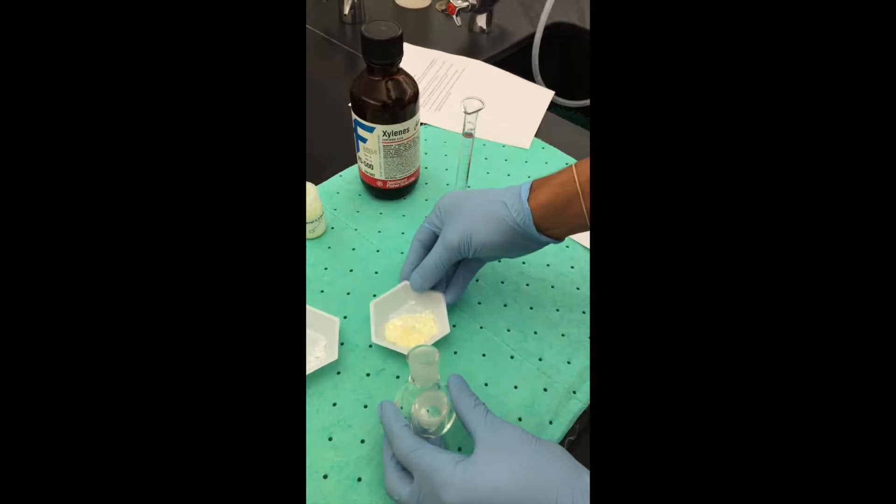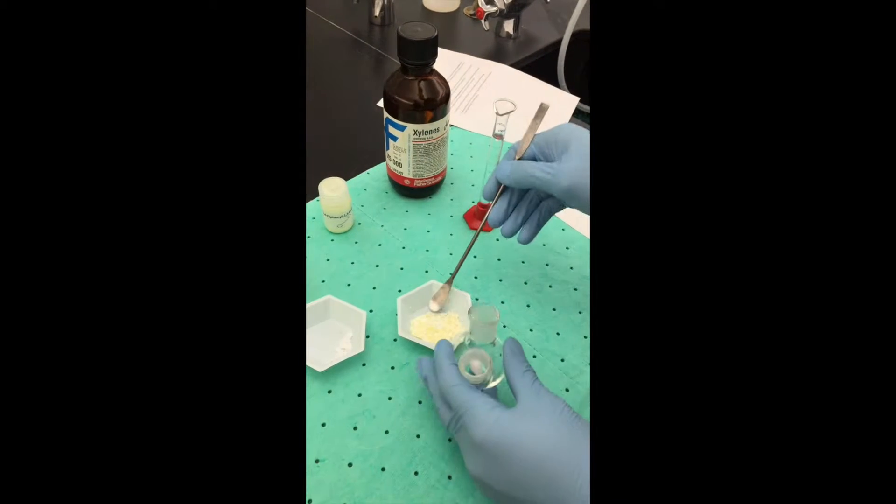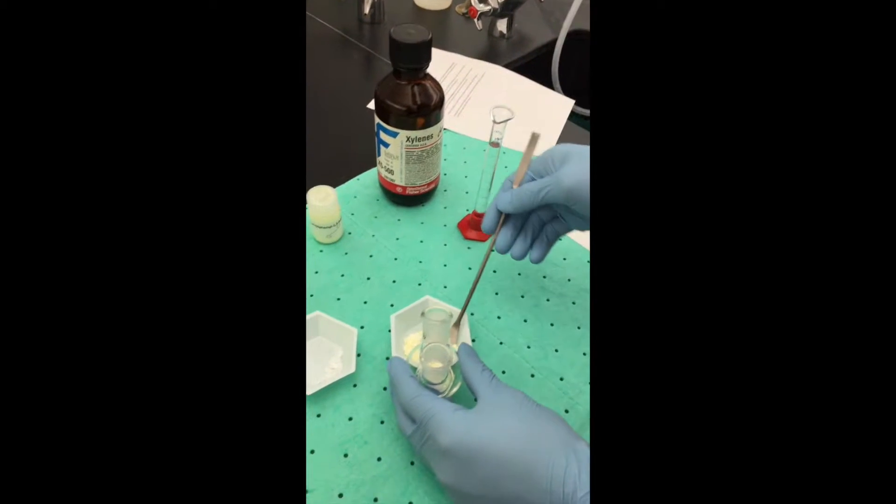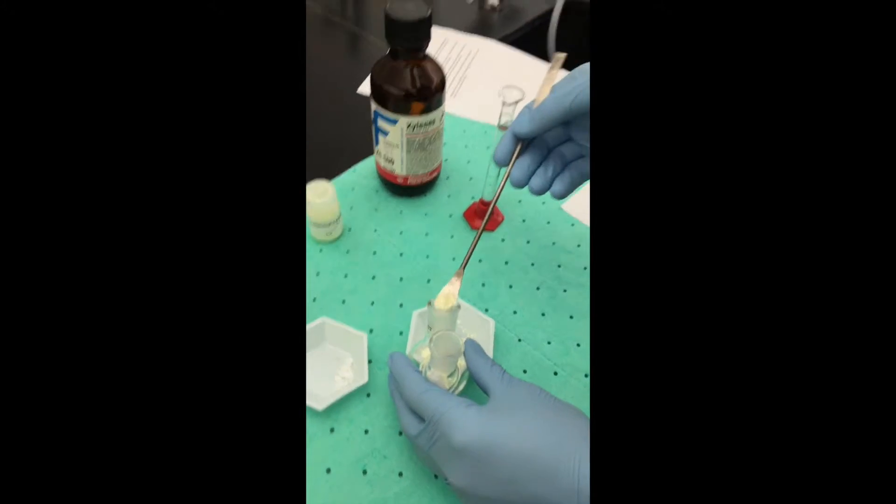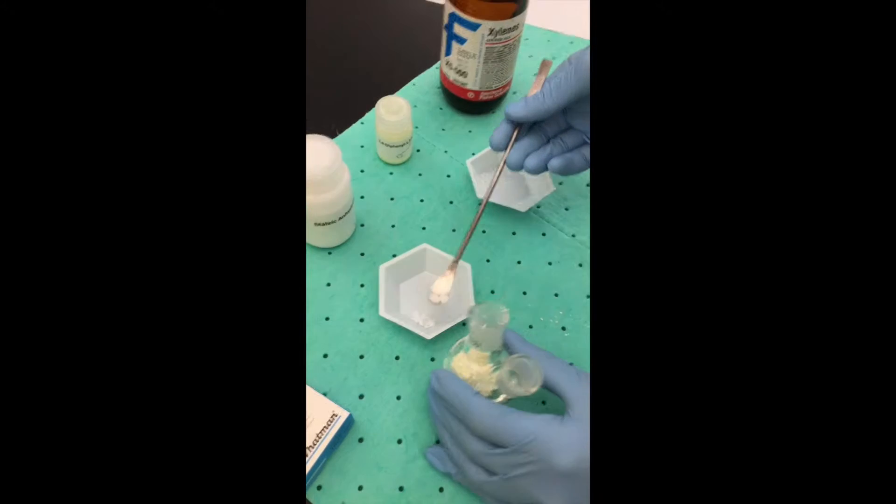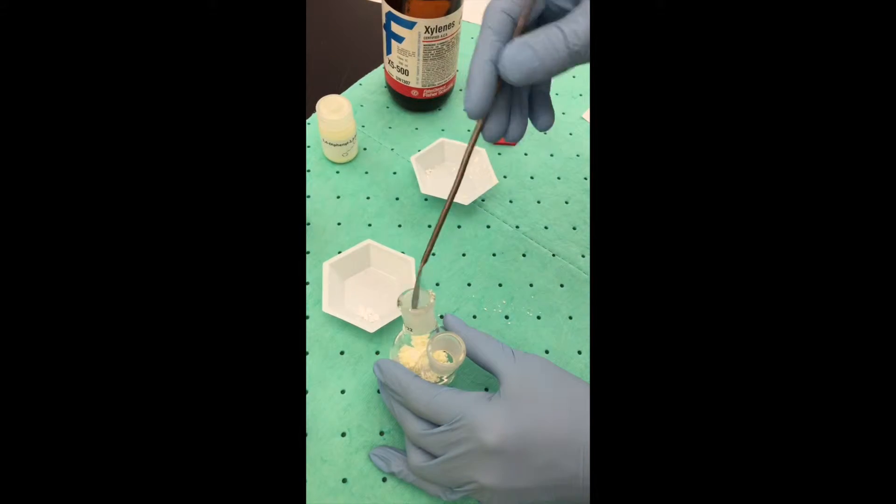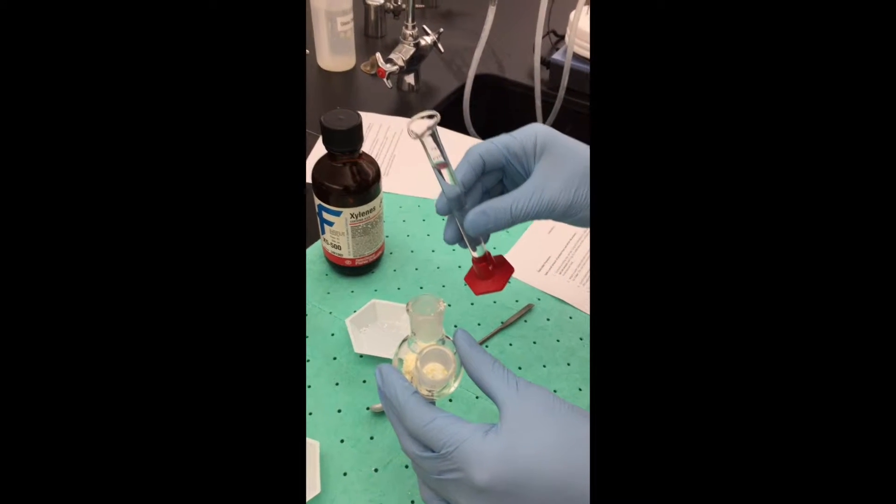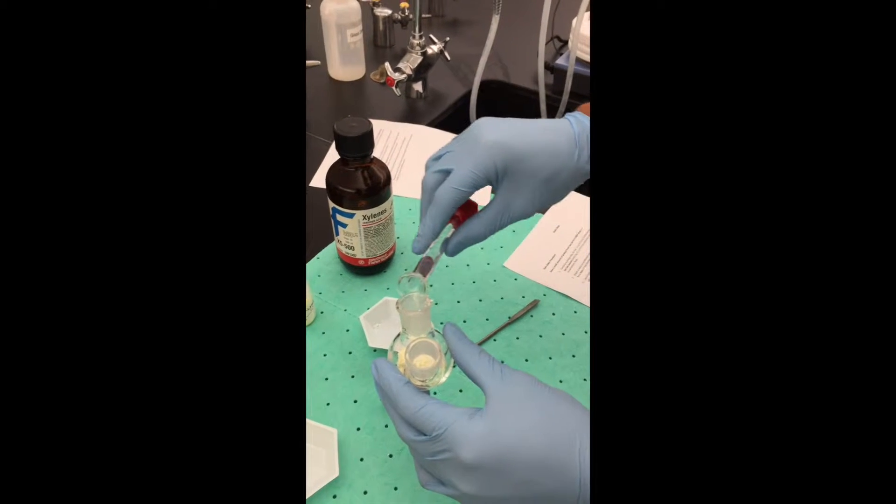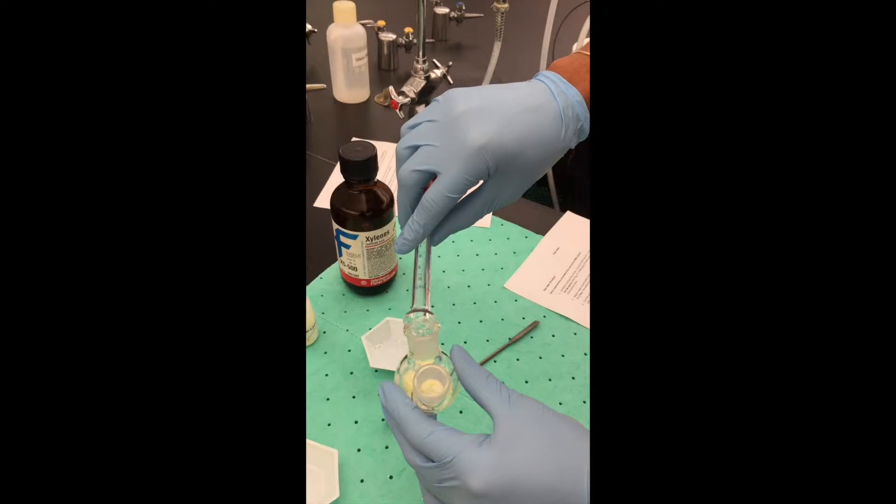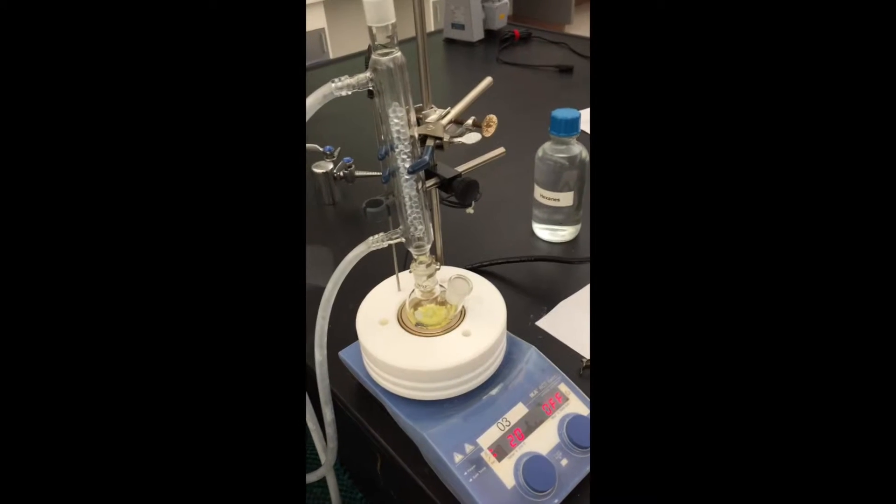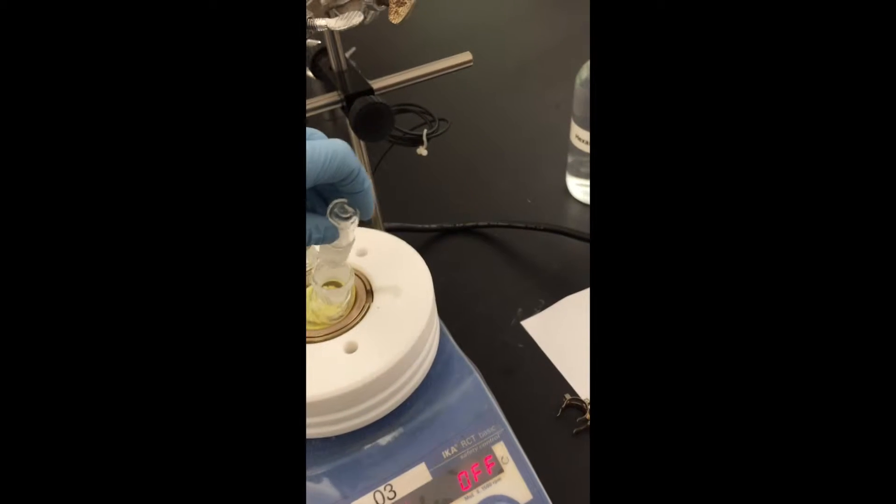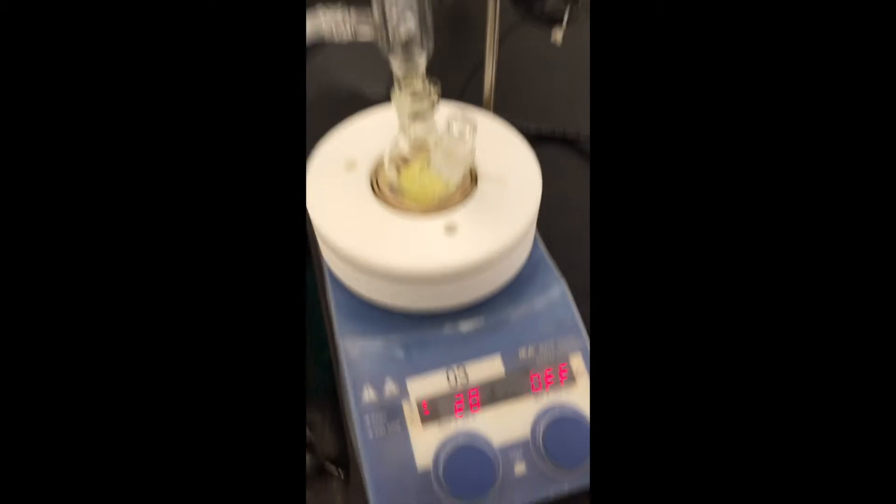Alright, so we are going to put the 1 gram of the 1,4-diphenylbutadiene in there. We are going to put the 0.5 grams of Maleic Anhydride in. Lastly, we are going to put the 10 milliliters of xylenes in. Okay, we are all set. So we are going to cap to reflux for an hour.